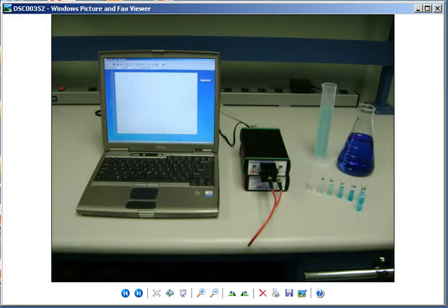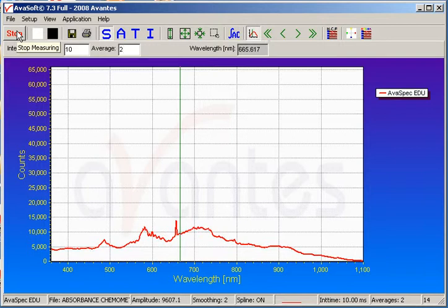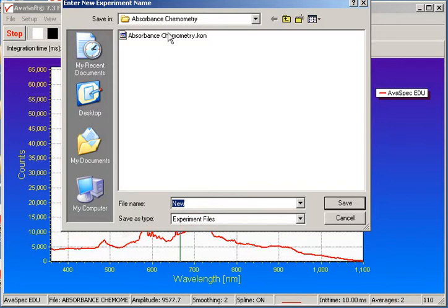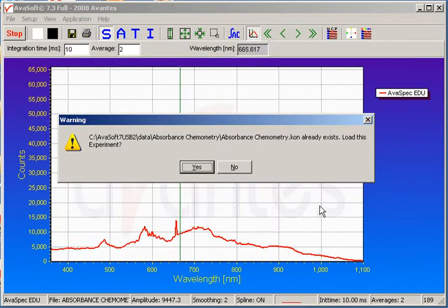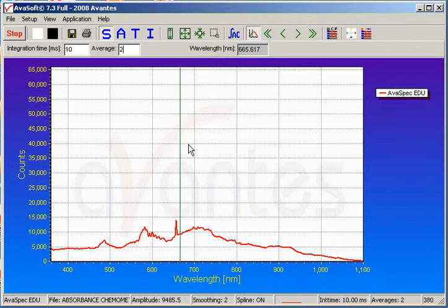Now we are ready to move into AvaSoft to begin our experiment. First we need to click Start to launch the software, then go to File, Start New Experiment. We will reuse the name Absorbance Chemometry. After saving, the software asks to reload since that name already existed. Going forward, any spectrum we save will begin with the filename Absorbance Chemometry and have a number appended thereafter.